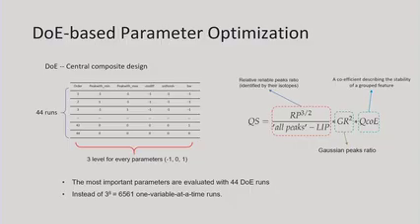So by using this design, we reduce the optimization steps a lot, while increasing the performance. And then we evaluate the quality of parameter optimization by using a formula. We will consider the peak shapes, peak stability, as well as the isotope information inside the data.